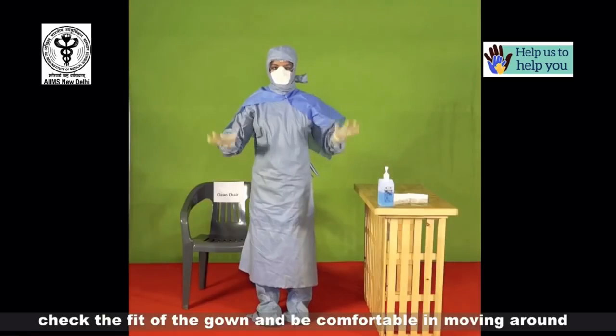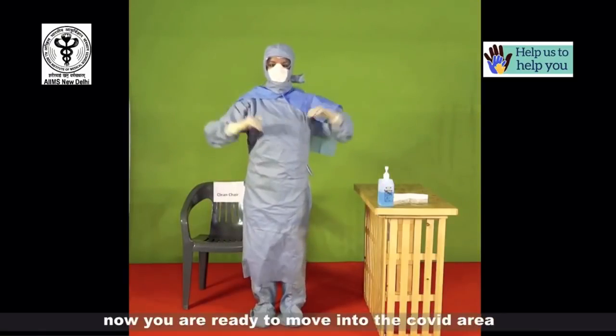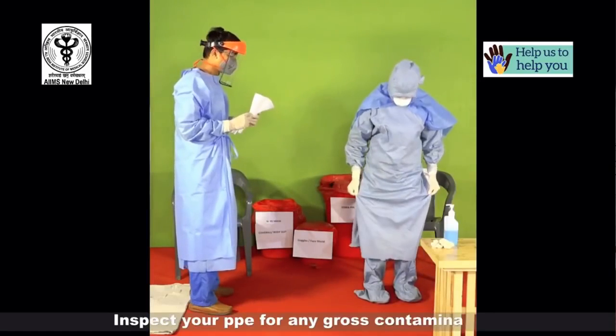Check the fit of the gown and be comfortable in moving around. Now you're ready to move into the COVID area. Doffing or taking off the PPE must be done in a designated doffing area having red biomedical waste bins labeled separately for each type of protective equipment. There should be two chairs labeled as clean and dirty, preferably made of plastic or metal which are easy to disinfect. It is very essential to perform each step with utmost care and slowly so as to not generate any aerosol. Perform hand hygiene after each step. Take the help of the observer to check for any air leaks or tears in the PPE during the entire doffing procedure; the observer must not touch your PPE. Inspect for any gross contamination.